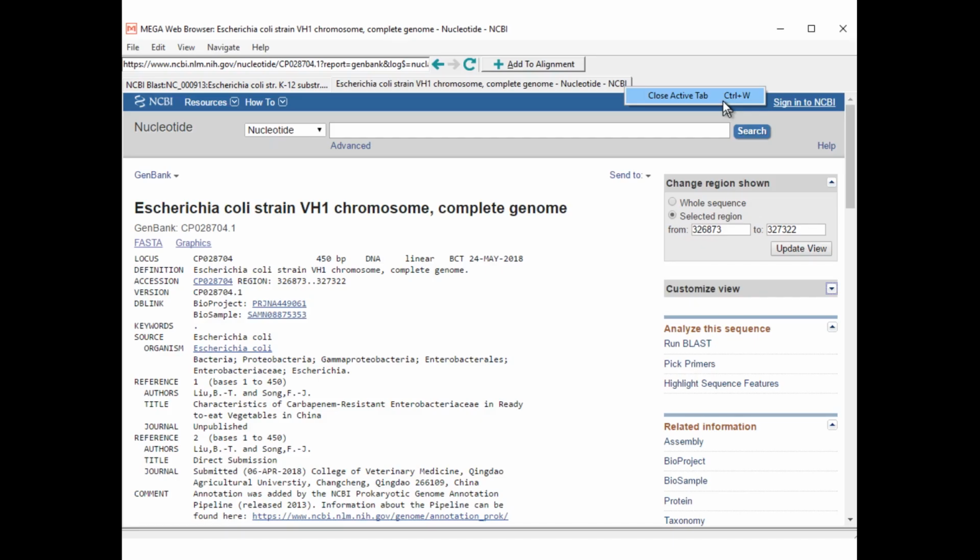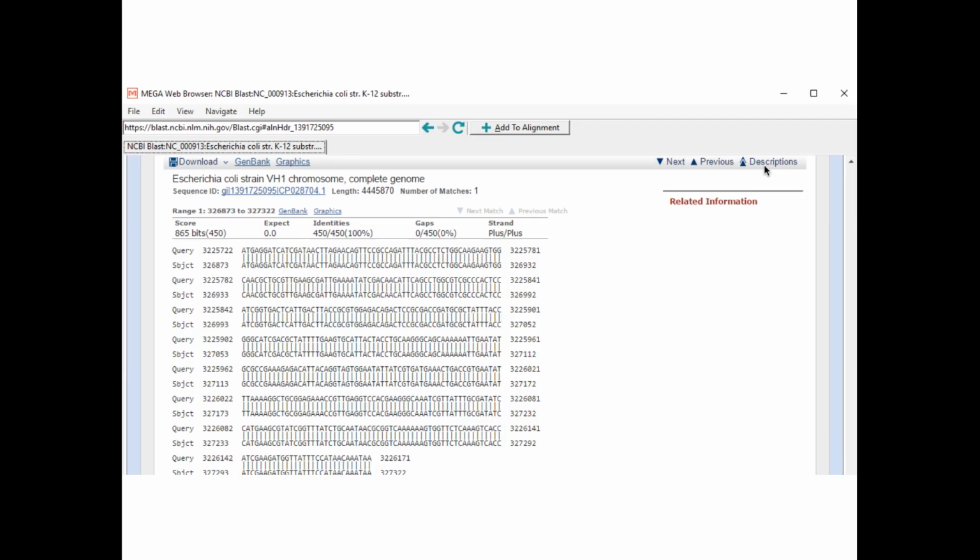So now we're done with that. We've added it. We'll go back to the file, and here's that tab that we're looking at. The first thing to do is close that tab, which you can do by command selecting it and control clicking, or just hitting Control W. It will close that tab and take us back right where we were in the output file.